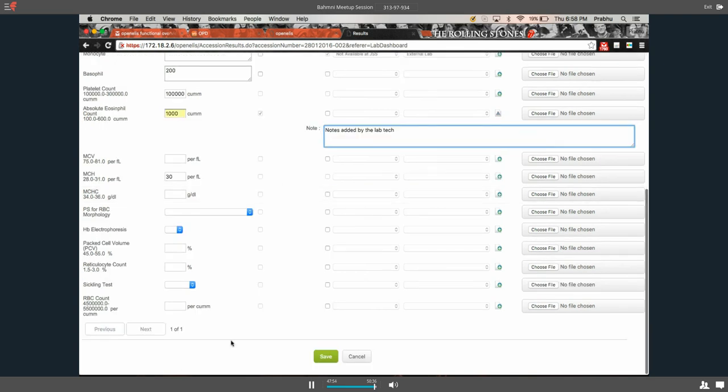It wasn't glucose, but it was something else. I might be wrong on that. The standard test could go up to 17, or 17 and a half, on the equipment.